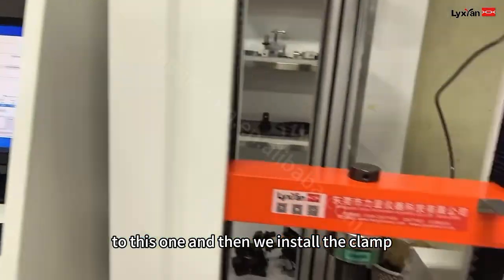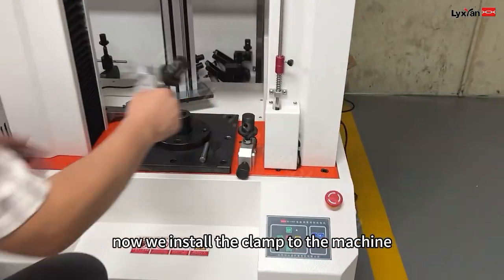And then we install the drive. Now we install the drive.